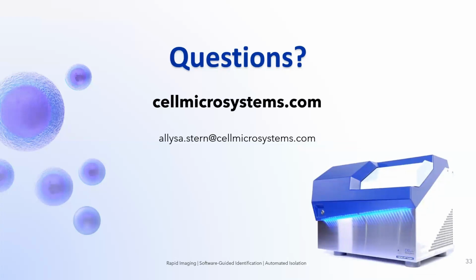Okay. Have you used this method for kidney organoids? I just started working with kidney organoids, so I'm really excited about a suspension workflow that starts in the Cero to develop EBs and the 3D precursors for kidney differentiation. That workflow is in progress.